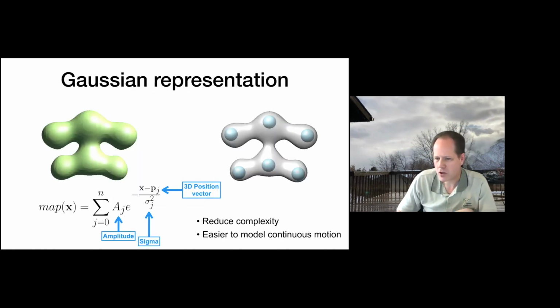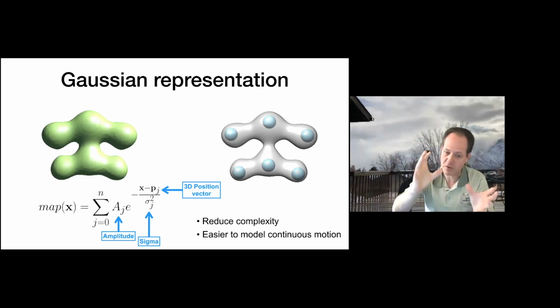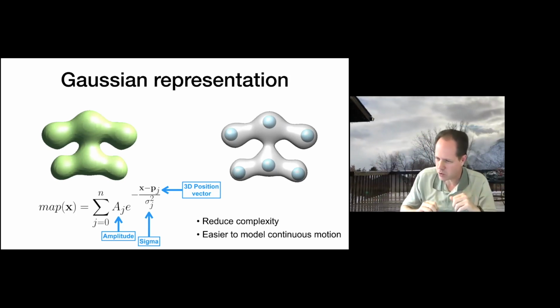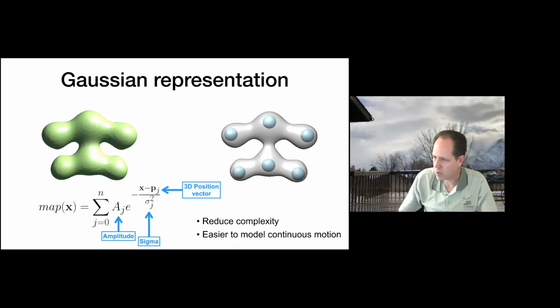So what we're doing with the Gaussian mixture model is a very specific decomposition of the problem, which allows us to map into a manifold method with a much better intuitive relationship to what's going on in reality. A lot of the manifold methods give you this abstract space and show you there are particles all through it. And they say, then in this part of the space, it kind of looks like this. And in this part, it kind of looks like this. Well, in the representation we're using with these Gaussians in real space, we can actually relate any point in this manifold space that we're going to get to eventually with a specific configuration in 3D space of these Gaussian blobs.